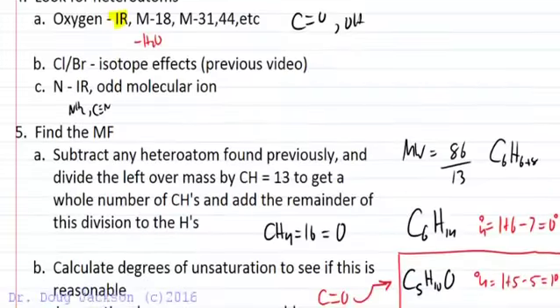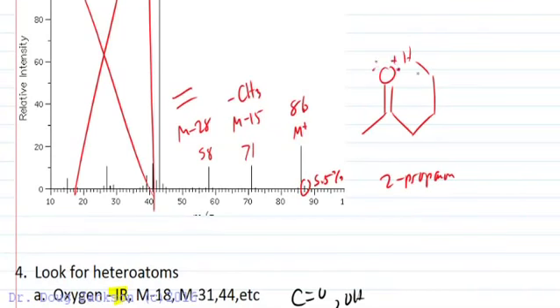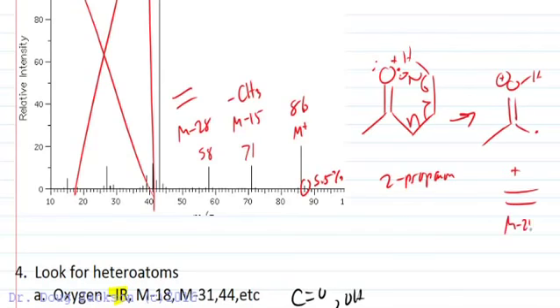We could also explain the different peaks here, and I know what the compound is, and it turns out it's 2-pentanone, 1, 2, 3, 4, 5, which would allow for a McLafferty rearrangement from this orientation to eliminate an ethylene, M-28. So that is very reasonable for this mass spectrum here.